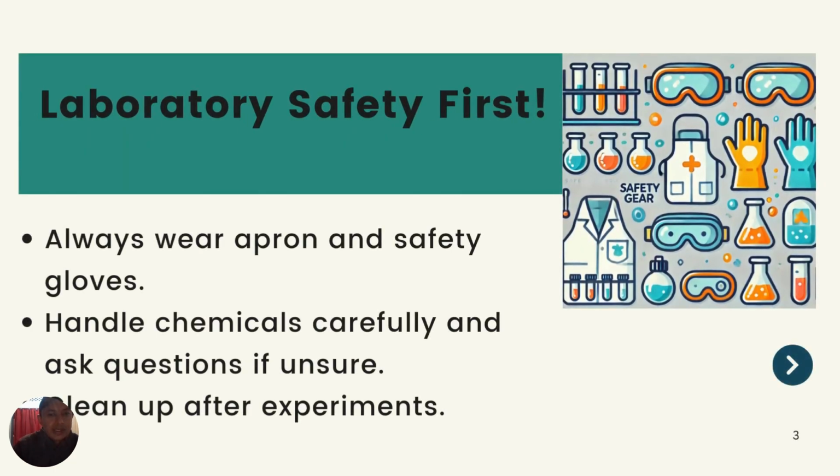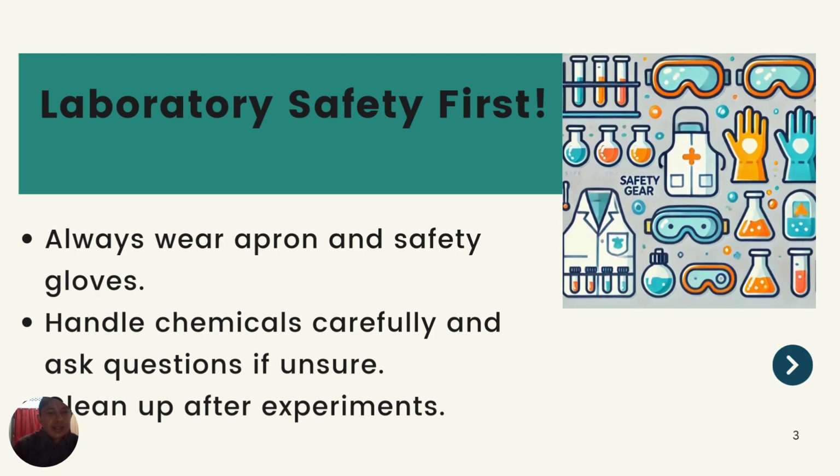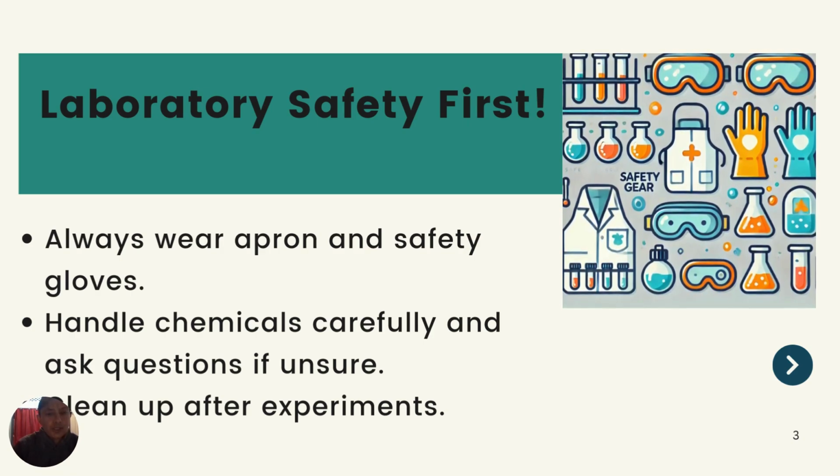As I said already, laboratory safety first, always. Safety comes first, because we know prevention is better than cure. Let's start with this. Always wear apron and safety gloves. Before touching any chemicals, please use apron and safety gloves, because concentrated acids damage our skin and our vital organs like eyes.